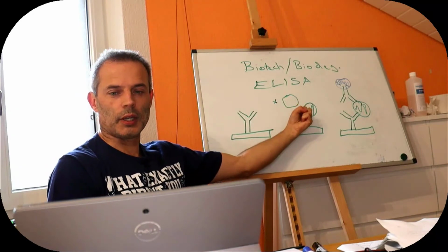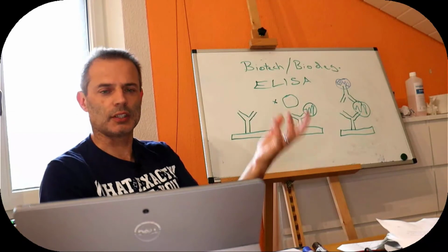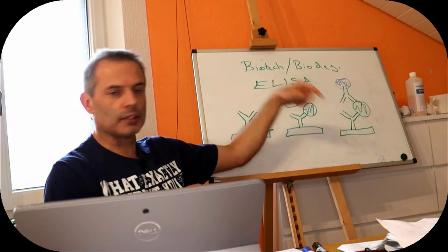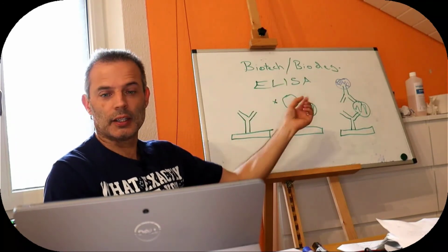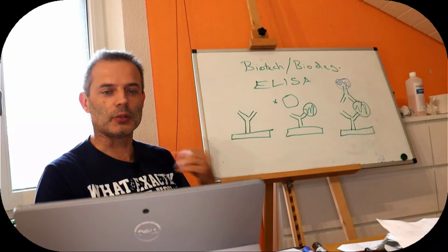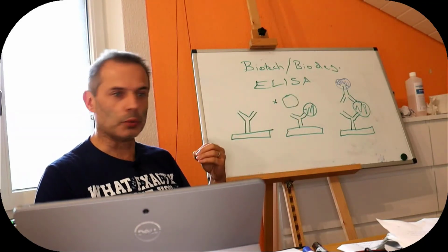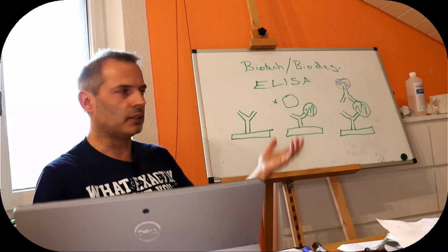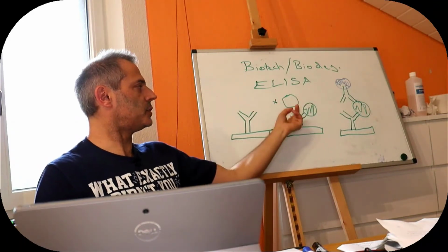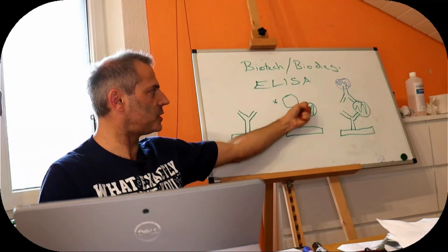Then we take my antibody, effectively my blood with the red blood cells taken out, because that's kind of red and nasty. So we just take the white fluid from it and we add it to the top. The antibodies go and attack the antigen, they attach to it, because that's what their job is. That's why they're causing me to be allergic to the poison in the first place. So obviously if they don't do that, that means that I'm cured anyway, so it is self-correcting.